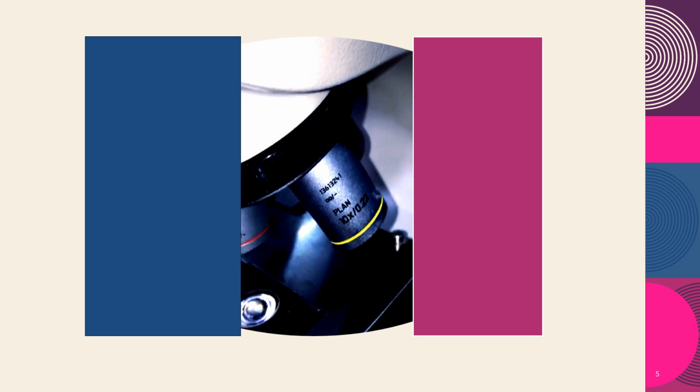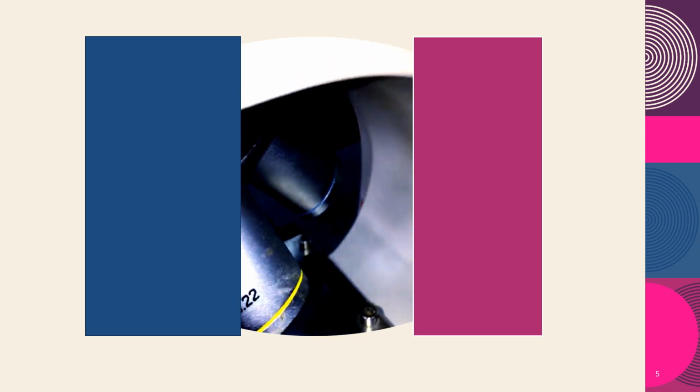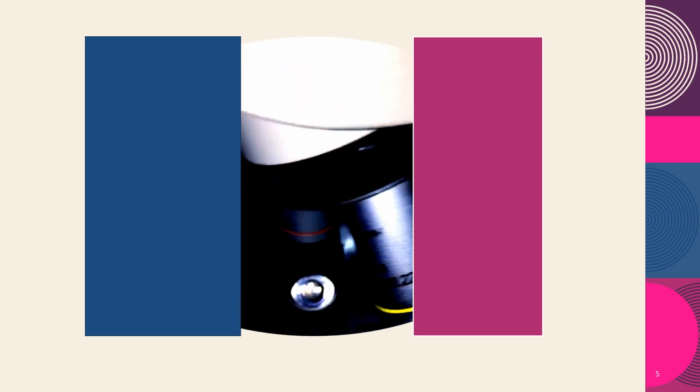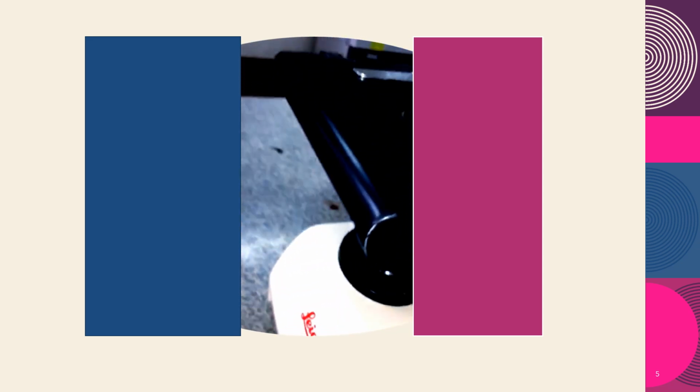I hope we've seen that. Then we have ×40 blue color coded, and the ×100 we saw previously, that was cream. The higher the magnification, the longer the objective lens and the bigger it is.